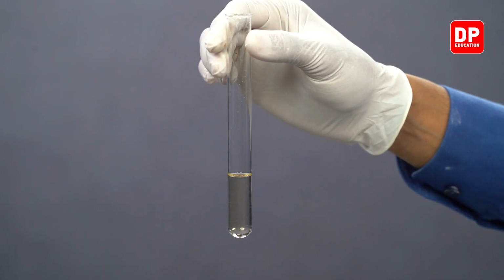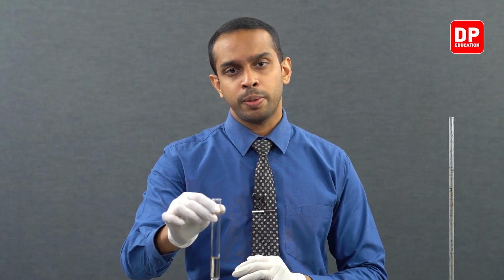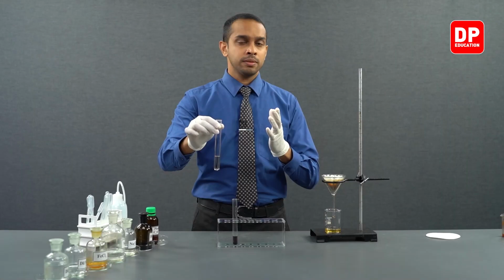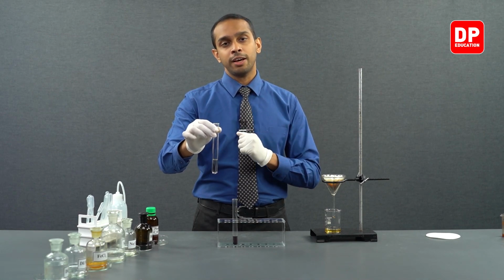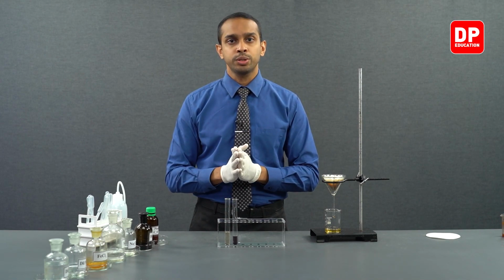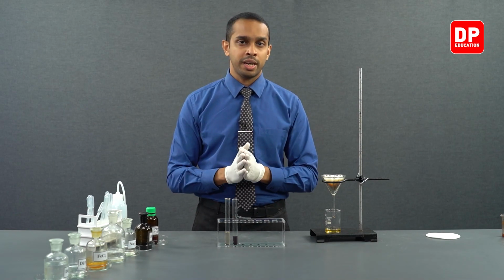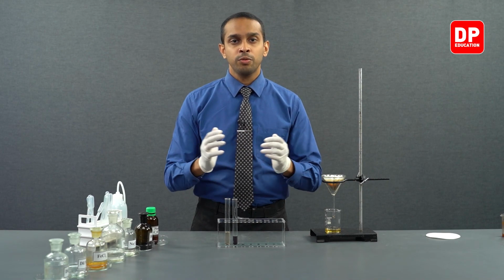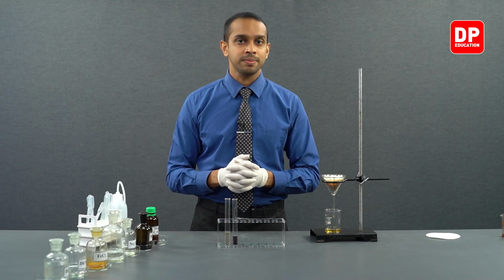This is because when H+ is added to the medium, phenoxide ion reacts with the H+ and forms phenol again. Therefore, the complex ion that gave us the violet color solution will break, and therefore we will not observe that violet color. So the purple or violet color of the solution was due to a complex formation between Fe3+ and phenoxide anion, and when H+ is introduced, phenoxide anion will turn into phenol, thereby breaking the complex.